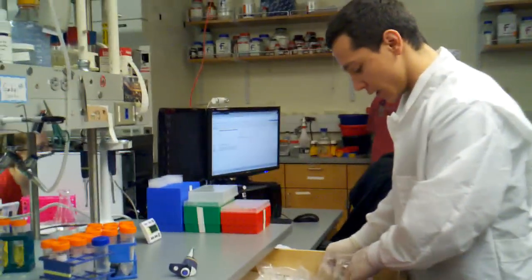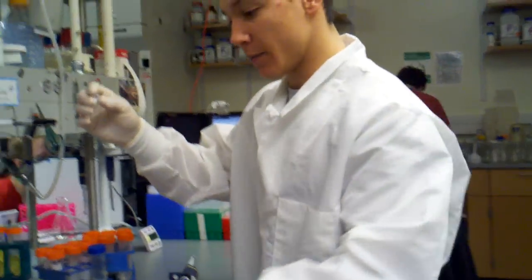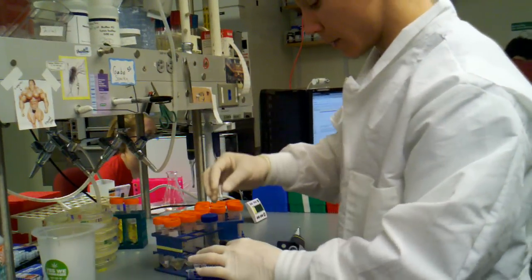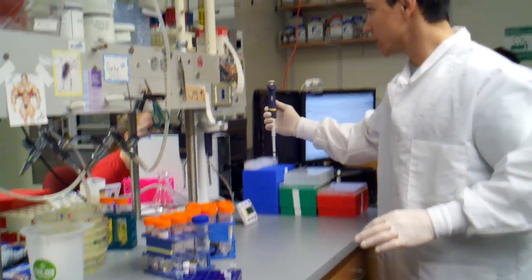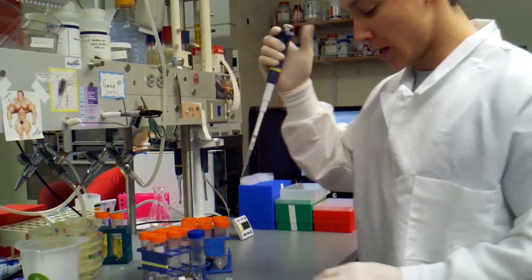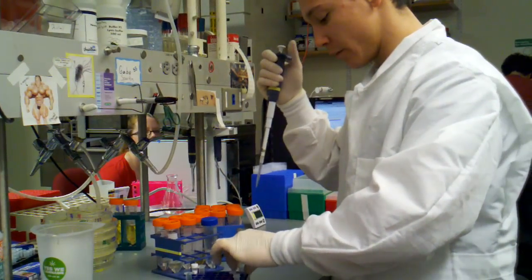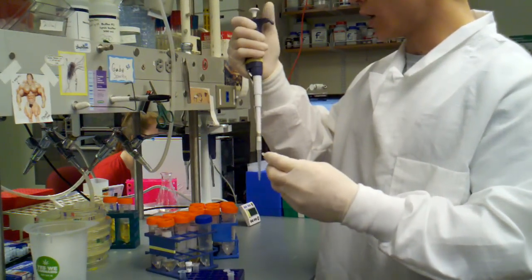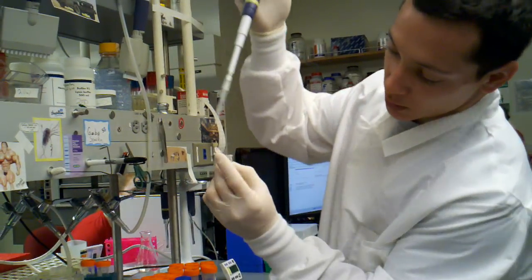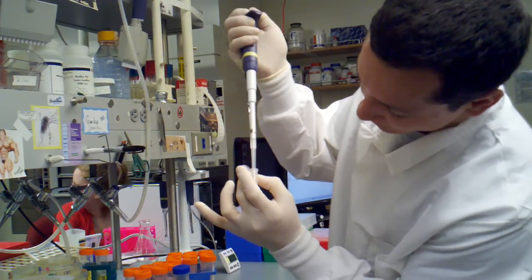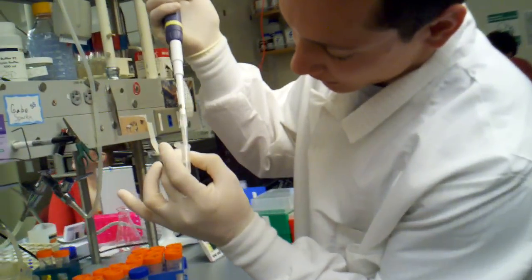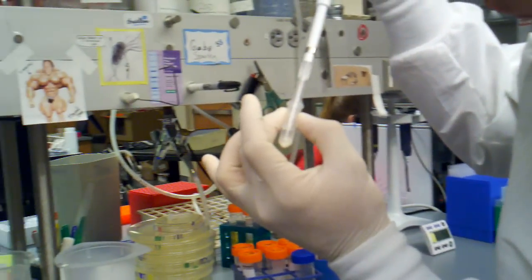We're going to pipette it into a mini prep column. I'll set my P1000 to the full 1000, which is more volume than we actually have, but it allows you to try to get it all in one fell swoop. I'm going to carefully put my pipette tip in, and the top of the liquid has a layer of white stuff that you want to try to avoid.